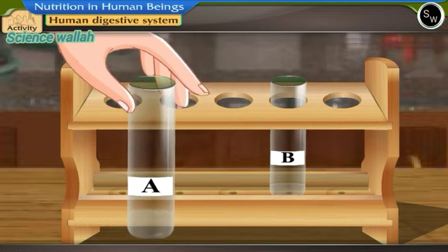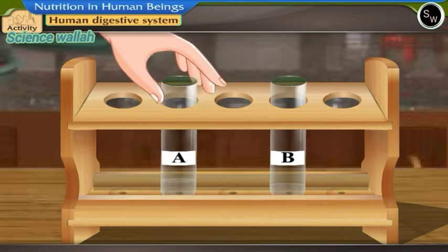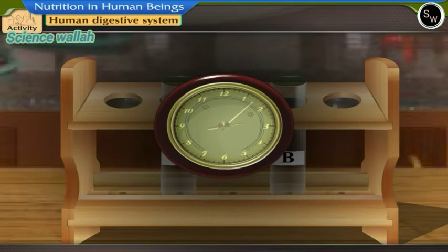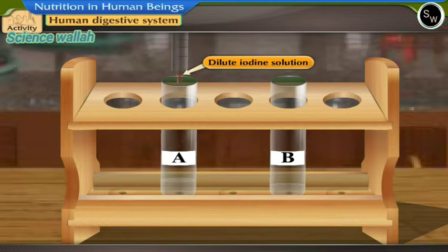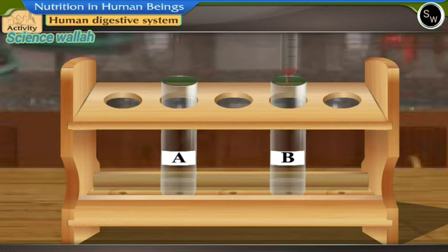Shake well. Keep both the test tubes undisturbed for 20-30 minutes in a test tube stand. Add two drops of dilute iodine solution to both the test tubes.